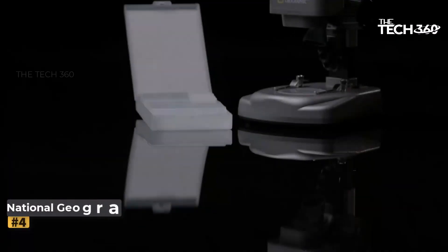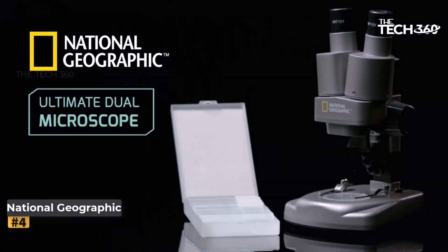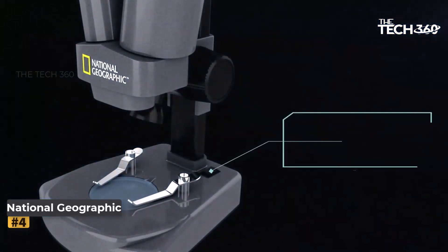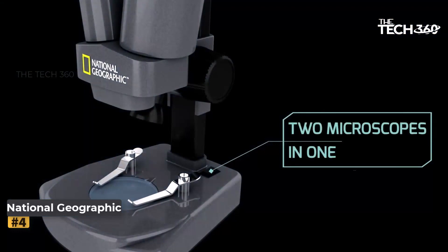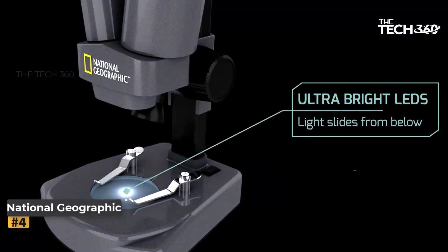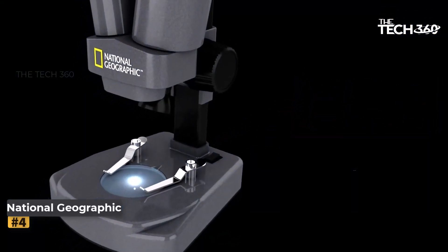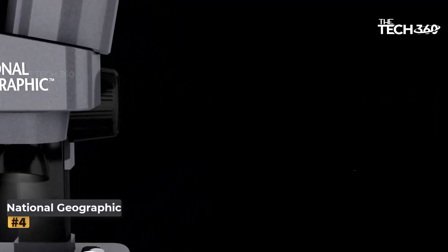Number 4: National Geographic Dual LED Microscope. Designed for young scientists aged 8 to 12, the National Geographic Dual LED Microscope is an engaging and educational option. It comes with 35 ready-prepared slides, allowing children to start exploring immediately.